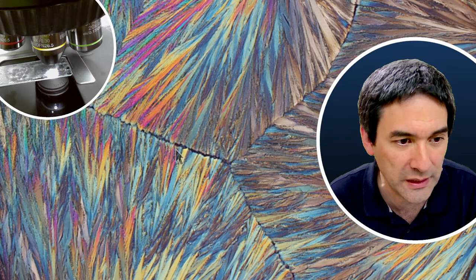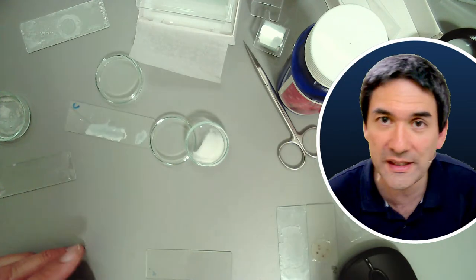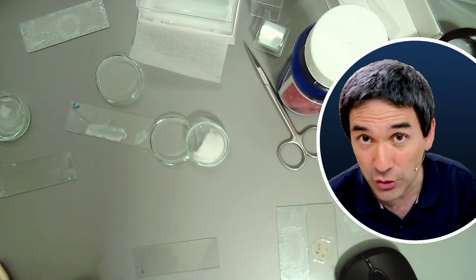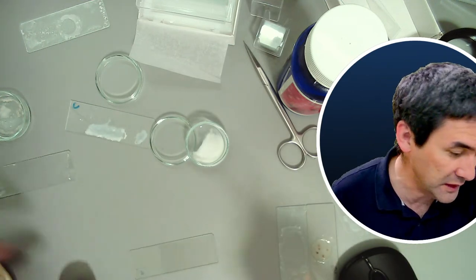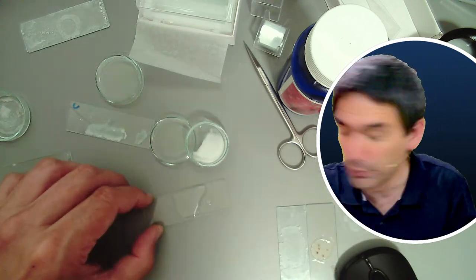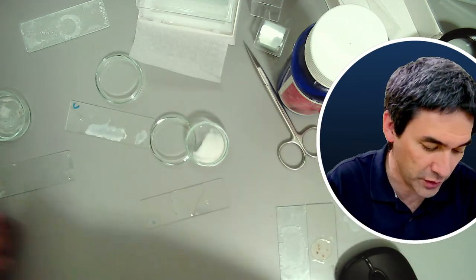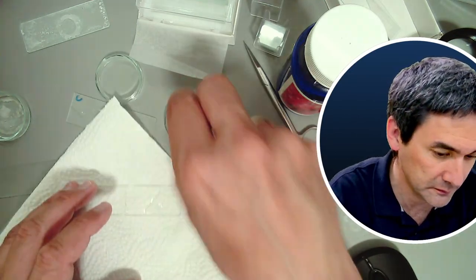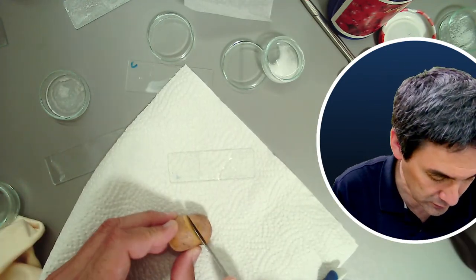We're going to switch over to the desk. Honestly, this is something I have not tried yet. I have not looked at starch grains under a stereomicroscope, so I do not know whether the size and the magnification is right or not. We're just going to give it a try. We need a little bit of water here, I'm going to put a tissue paper beneath it. I love improvisation here. So let's put it here on some tissue paper. Let's rearrange the camera here. Over here, a potato.